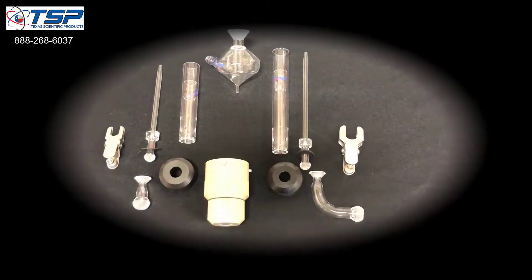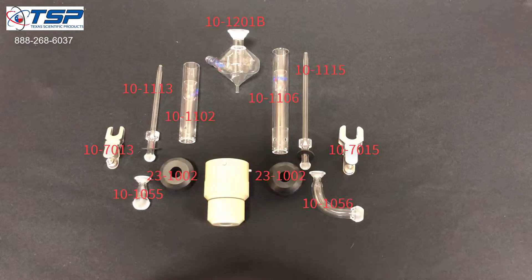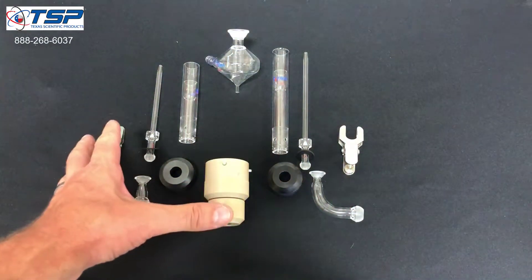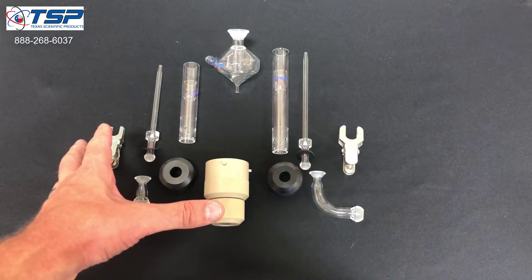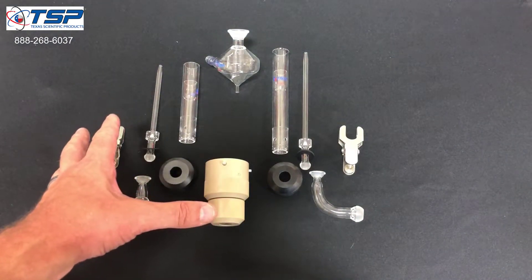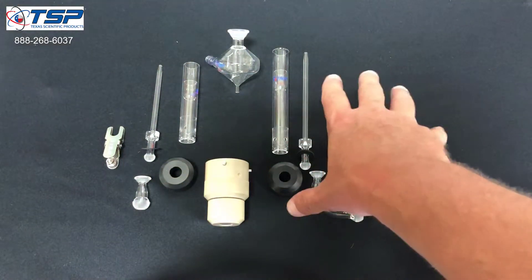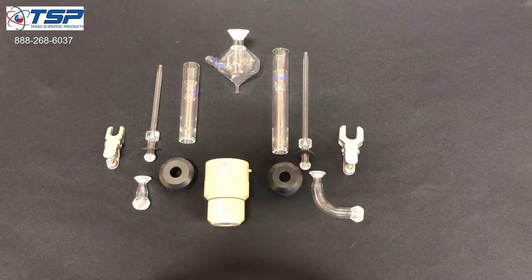Hi, this is Bruce Moulton with Texas Scientific Products. Today we're going to assemble the torch, injector, and adapters and spray chamber for an Arcos MV. We're going to do the radial side of the system using the items on this side of the table, and then we've got the axial side that we're going to do on the right-hand side.